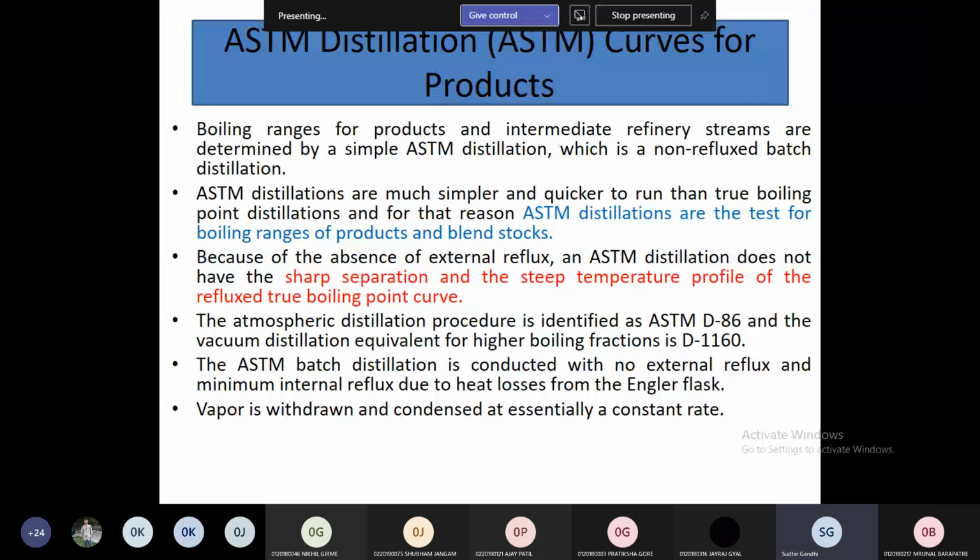Actually it is a sample taken by government officers, and they collected it and sent that sample to us for testing. What used to happen is that there is blending of kerosene into gasoline, and they wanted that to be characterized. So how much percentage is blended, or is it only pure gasoline? That needed to be characterized.